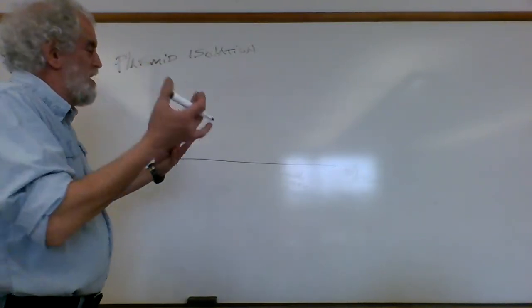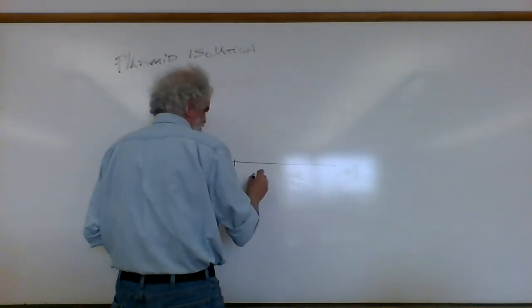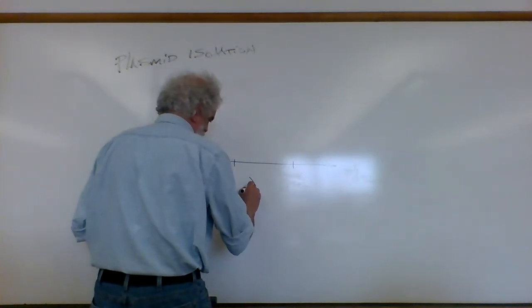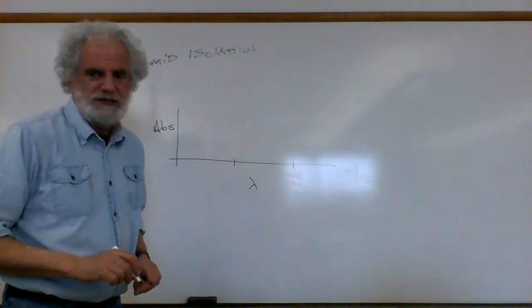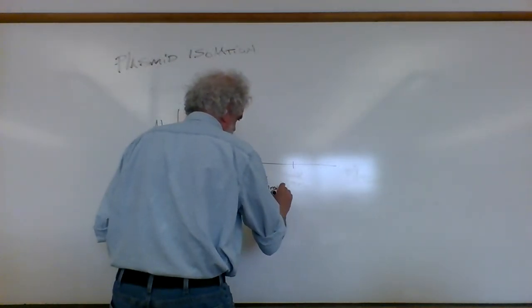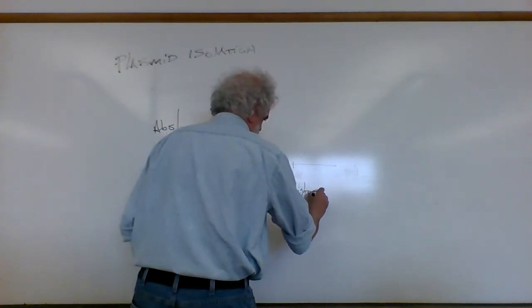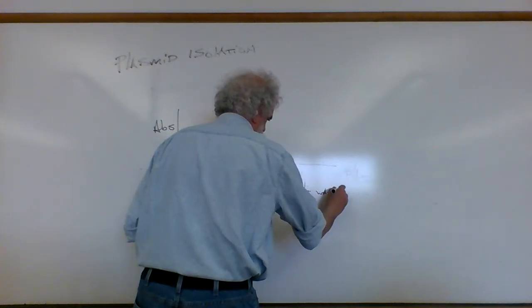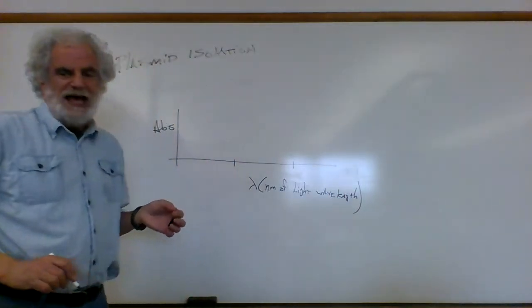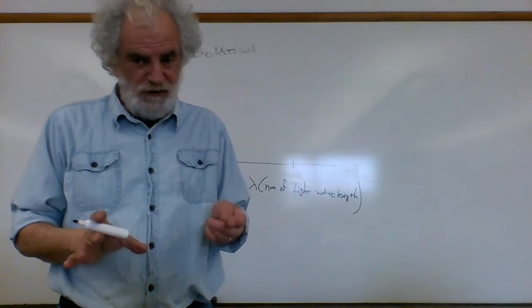of DNA we have. Here's how we get this information: there are two wavelengths of light, and wavelength of light is abbreviated lambda. That's the nanometers of light wavelength, and UV light is starting around 300 nanometers.